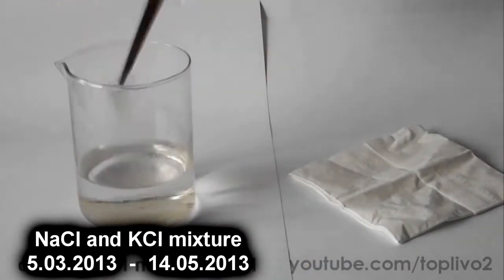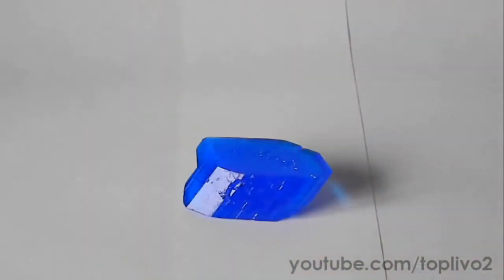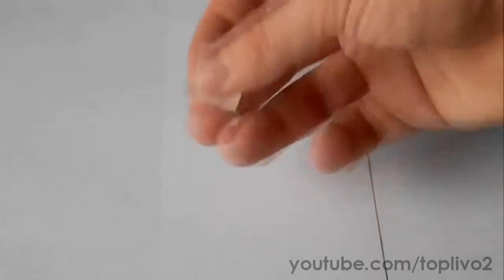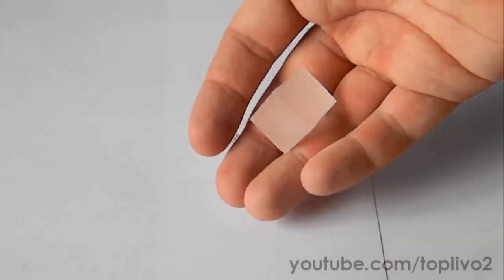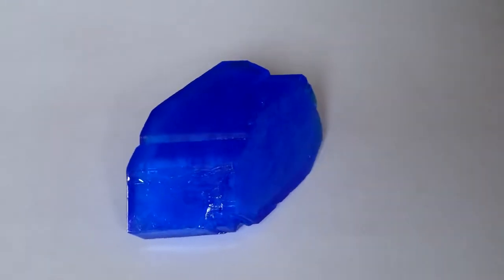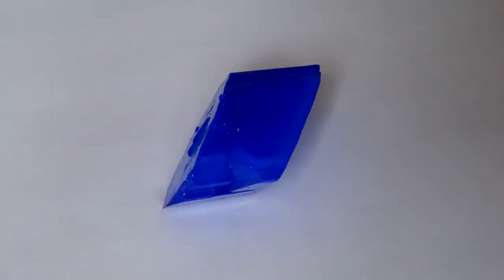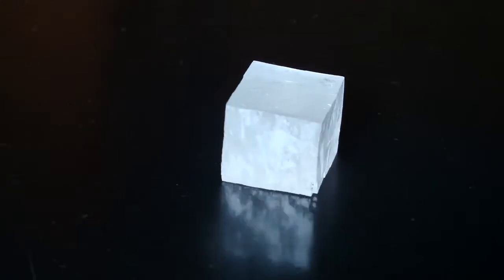My second crystal, the mixture of sodium chloride and potassium chloride, has also grown well. I am covering its surface with lacquer. After the lacquer has dried, the crystal can be handled with bare hands. As you can see, the crystals are very beautiful and quite smooth. And now, ladies and gentlemen, as we have done a long journey growing these crystals, let's just enjoy their beauty without any further comments.